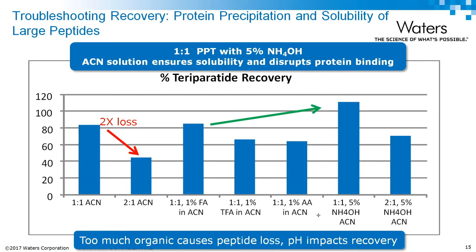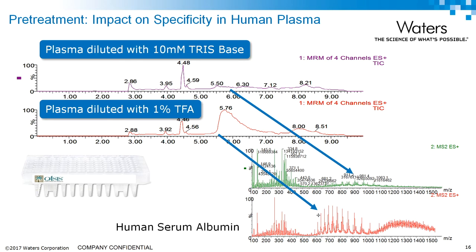Let's talk about solubility with an example for teraparatide — also a sticky, larger peptide. In elution solutions you don't want too much organic, and the same holds true for a precipitation pretreatment. At a one-to-one organic to plasma ratio, recovery is pretty good, but when you use more organic, you lose about half of the recovery because you start to precipitate the peptide. Additionally, looking at modifiers, better solubility for teraparatide is achieved under basic conditions than acidic conditions, resulting in about a 20% increase in recovery.